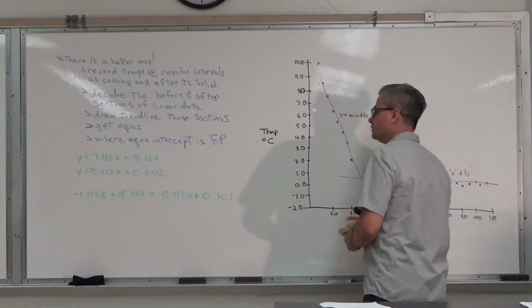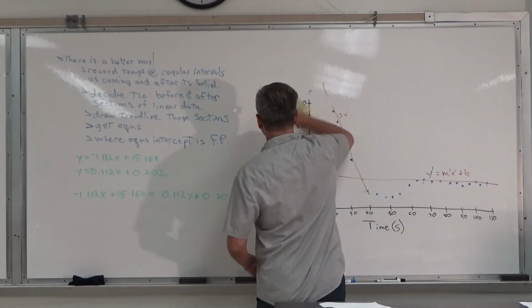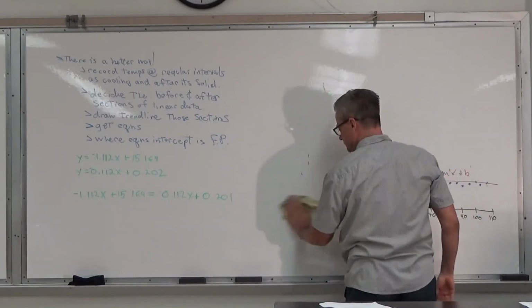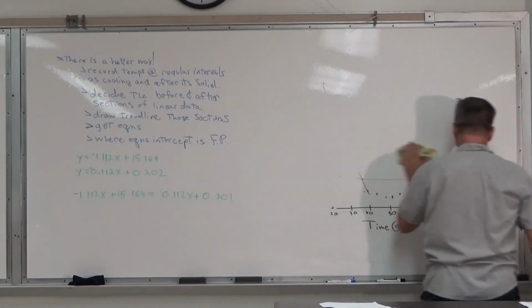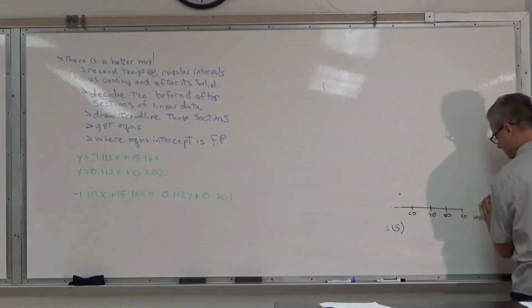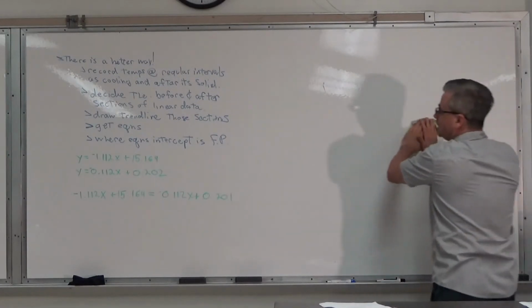Okay, last thing we're going to do. You're going to get, or I will run for you, an unknown non-electrolyte. So this is something where the van 't Hoff factor is 1.